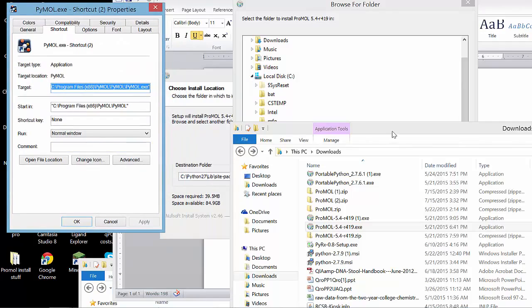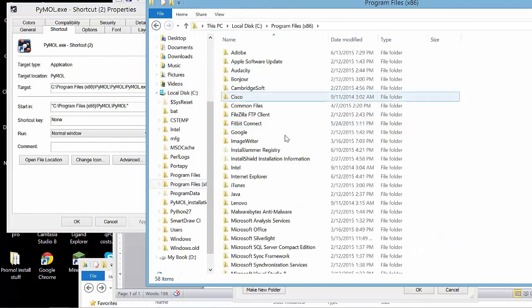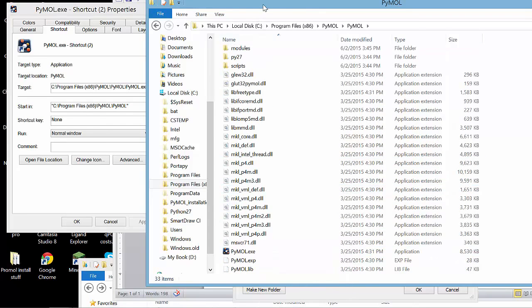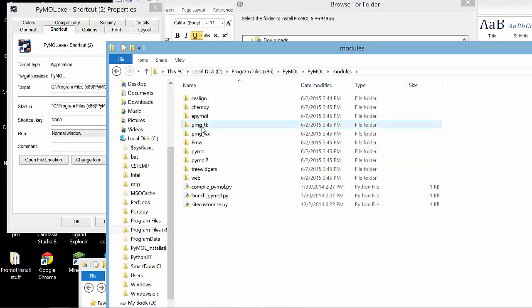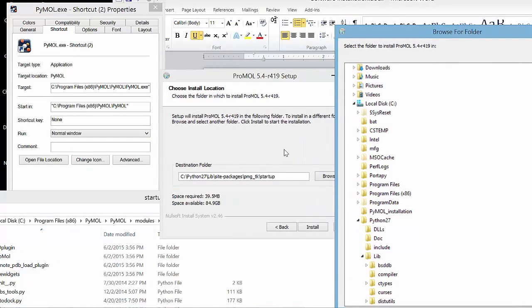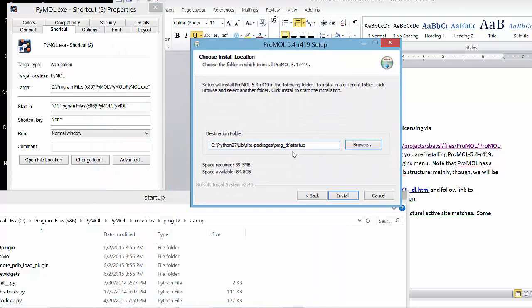Yeah, the free version, the free educational version, lives in here. So I would need to have that install in. All the way down in here. So the path that I need is, let me see if I can recreate that. So the path that I need is not that. I need that same folder, but in the PyMOL, not in the Python.